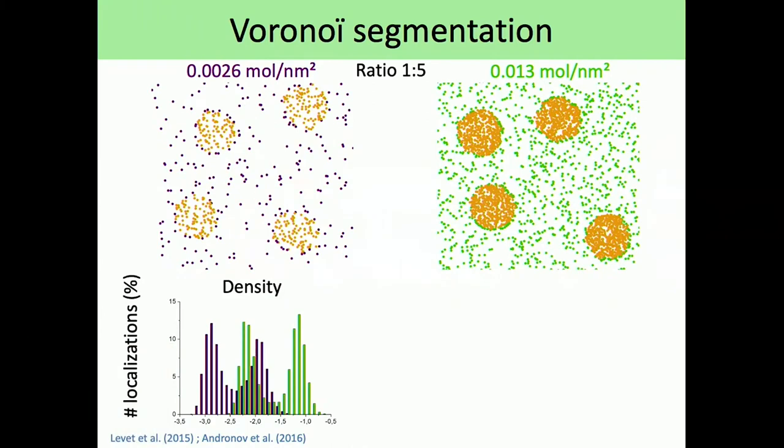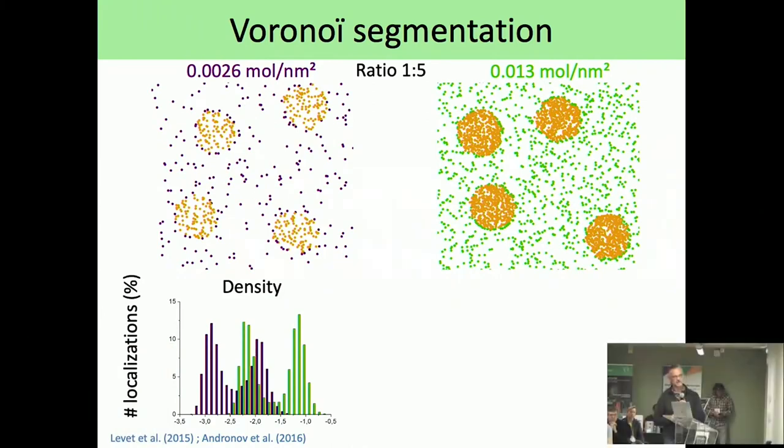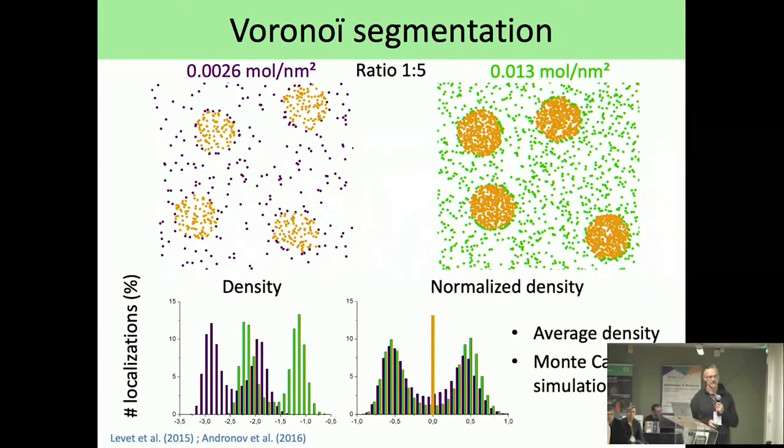The idea is that there are two different scenarios where the density is different in the simulation, and definitely I see that the cutoff here is a very simple thing. You have the background, and I have the object. So in the first population, I have the threshold here, and in the second population it is here. Of course it's not normalized, and that's always a problem. We want to compare conditions together, so we had to find a simple solution to have the technique normalized.